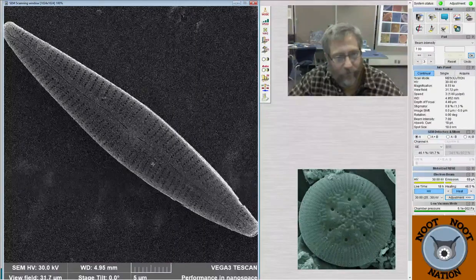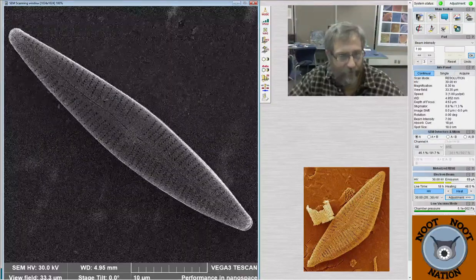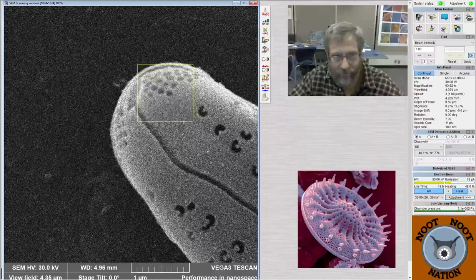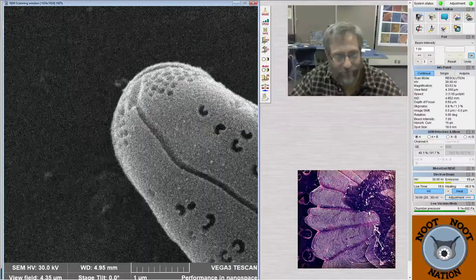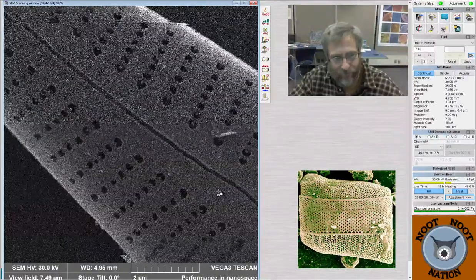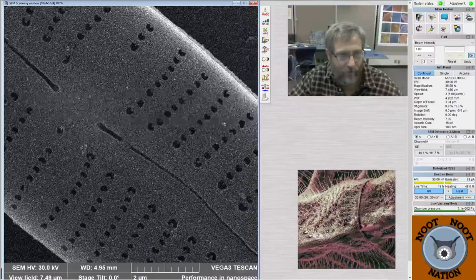And as usual, the Gomphonema has a foot pole and a head pole, and this one is a little bit wider than that one. So it's subtle, but if you thought of it as like a pen, this is the part that you would write with down here. And when you zoom in on the foot pole, there are little Pac-Mans down here; there should be an apical pore field. So if we got it right, and sometimes we didn't, but this time we did, the foot pole is this end. And so this is the raphe coming in, doing its business, splits through the apical pore field on the foot pole. And then on the other end, zooming up on the raphe, it's the proximal raphe ends. This is the central nodule. You can see it has a shortened stria, and over here a longer stria with a punctum at the end.